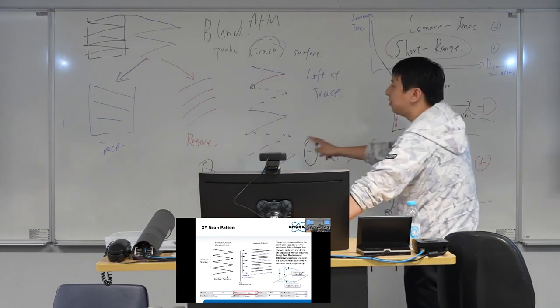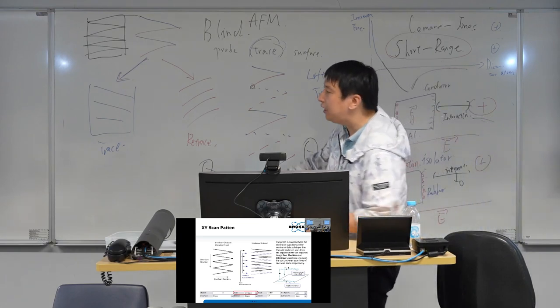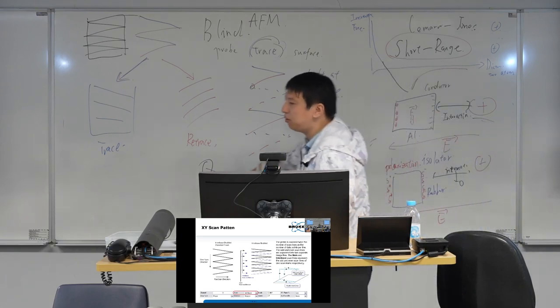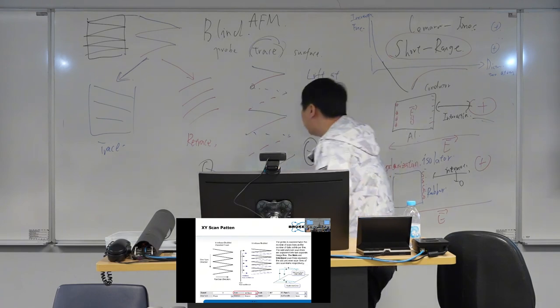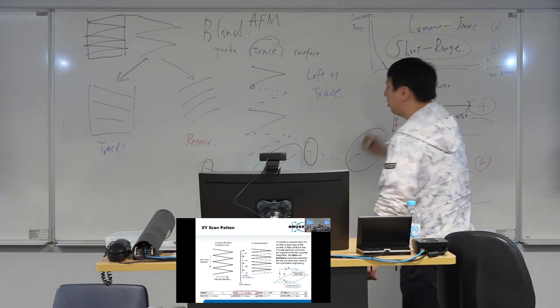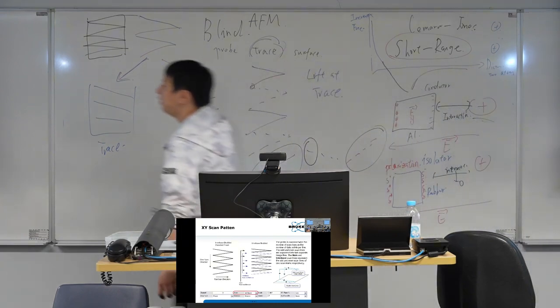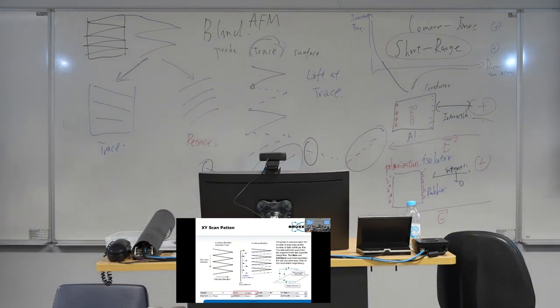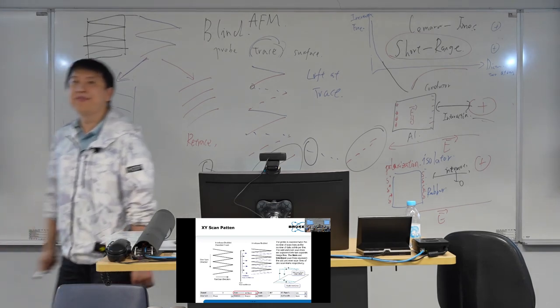Okay, that's the difference. So if we don't want to see this kind of lift and drop, what's our best choice? We take a look at the main retrace and the interleave retrace. So that's why our software default setting shows you only the retrace frames.